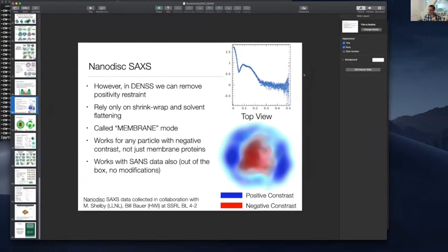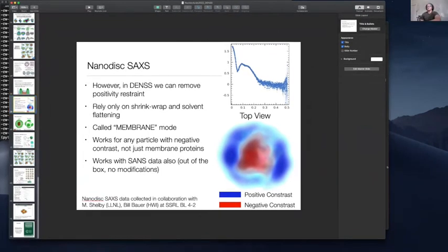Okay, is there any other question before I go on? Thomas, I had one question. Have you noticed any kind of size limit? How large have you done so far? Believe it or not, I have not noticed a size limit. I actually simulated tryptophan and was able to reconstruct tryptophan with a hole in it, which was really great. So there's no minimum size limit.